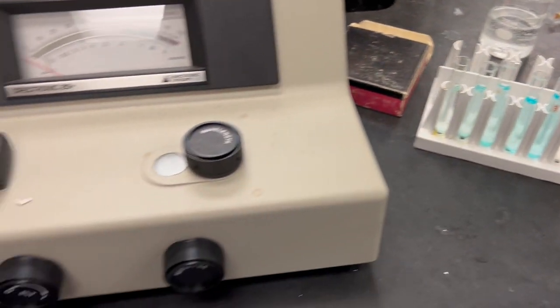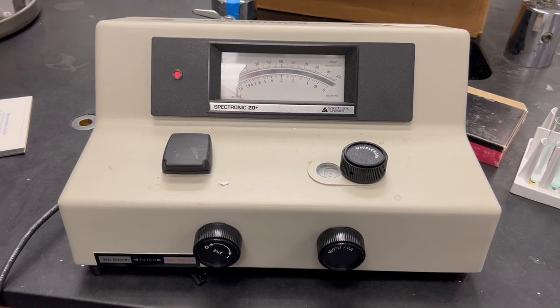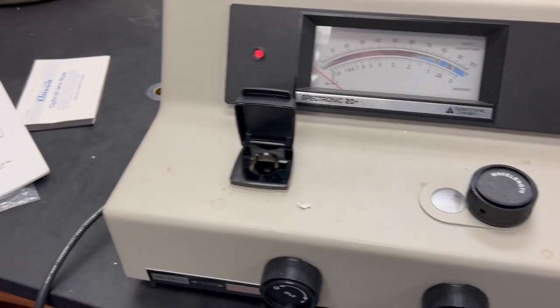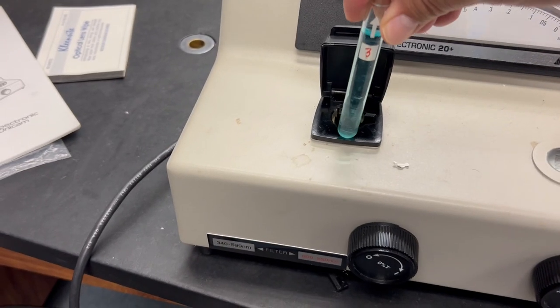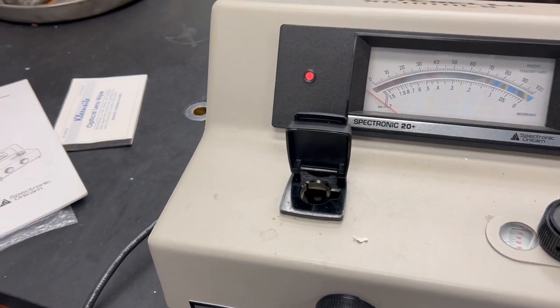Let's go over how you would use this. Here's your machine — the sample goes in here. You're going to line up the little arrow with the line right here. You point the arrow forward when you use it.